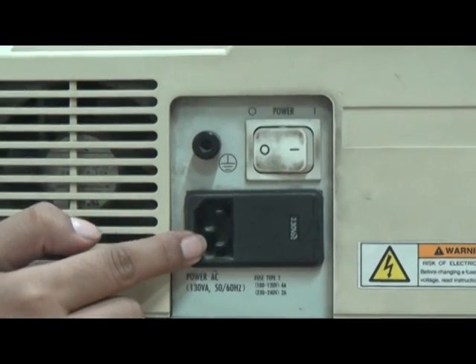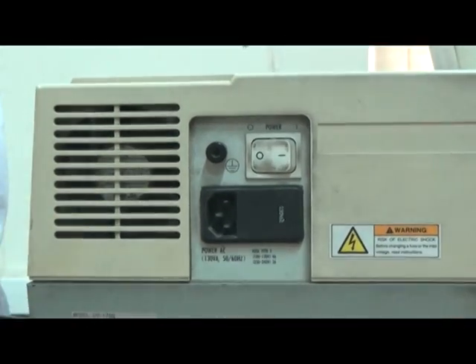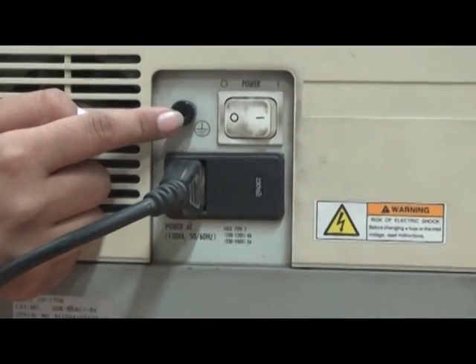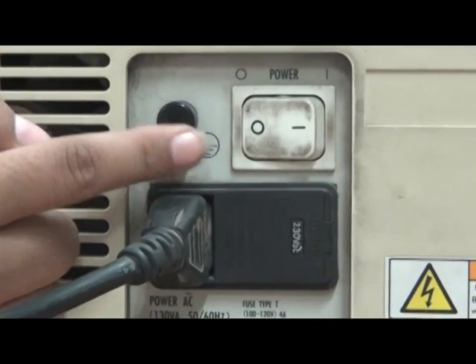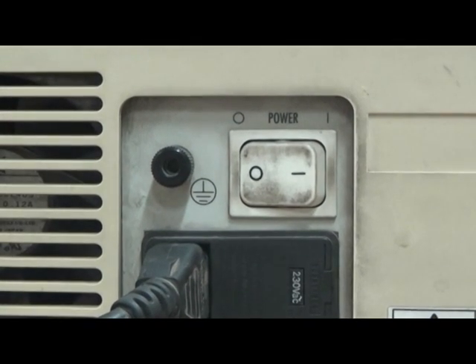This is called the AC power connector. Connect the enclosed AC power cable to supply power from the AC electrical outlet. This is called the ground terminal. This is the terminal for connecting to ground when using an ungrounded power supply. You must be sure to connect this ground terminal to ground.